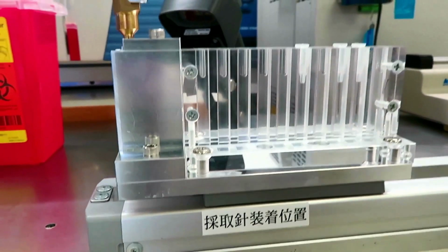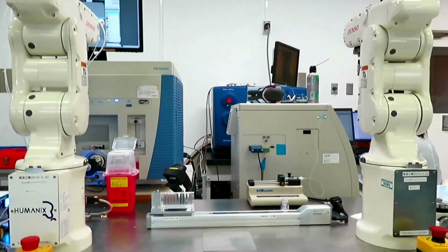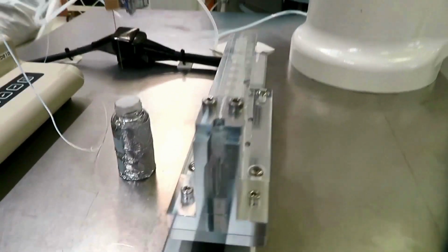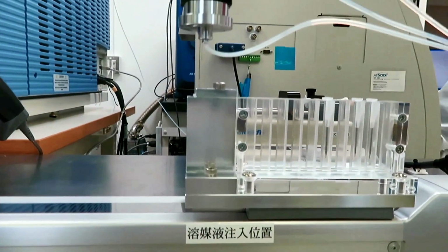I see I already finished my time, but one more minute. It goes to robot number 2 via the very cool rack that we built. And then the whole existence purpose for this robot number 2 is just to pipette our ionization solvent. It's a very sad existence, but it's okay. It's science. We do it for science.